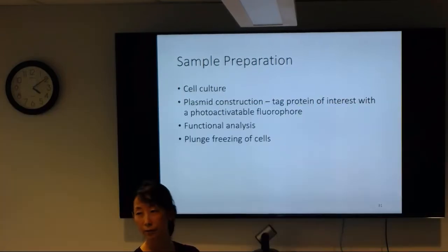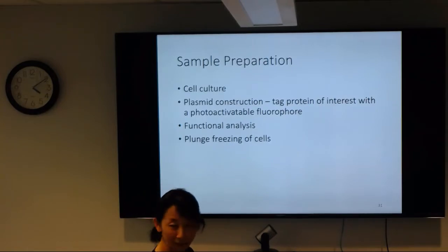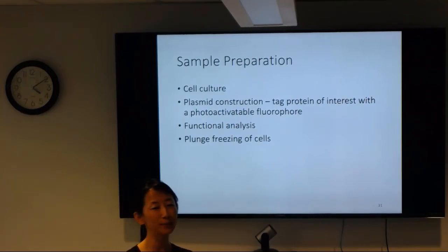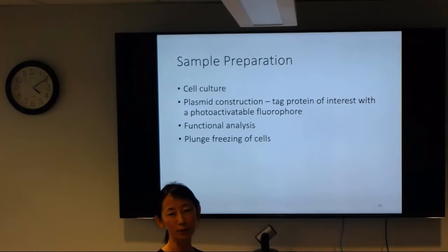I don't know if you have a Vitrobot here or not. But Mark 4, okay. And we have a Mark 2 and Mark 4. Okay. Yeah, this is a bacterium, only maybe 1 or 2 microns. So it's perfect for plunge freezing application.